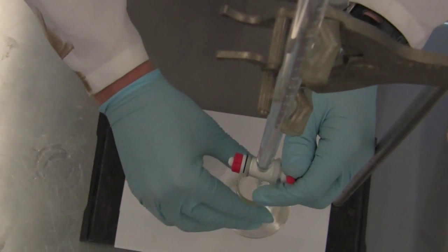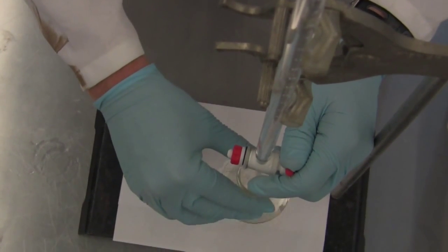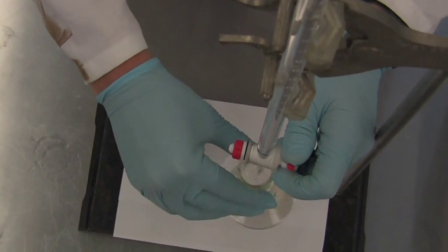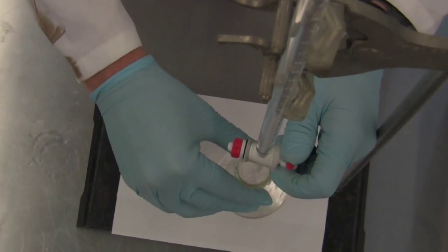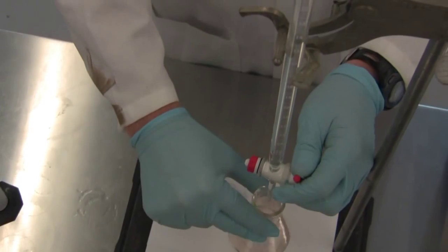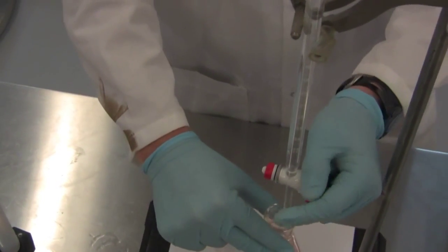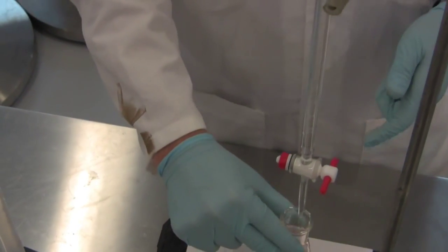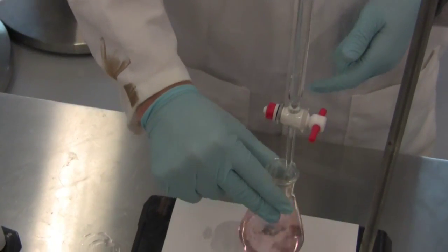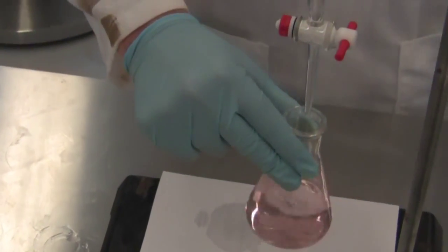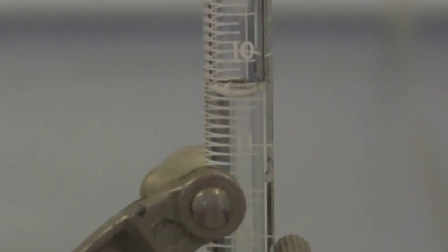It's okay to go a little bit faster at first, but as you get closer to where you think your endpoint's going to be, you'll have to slow down your titration. And there we have it, a nice light peach endpoint. Now we need to record our final volume, which is 10.45.